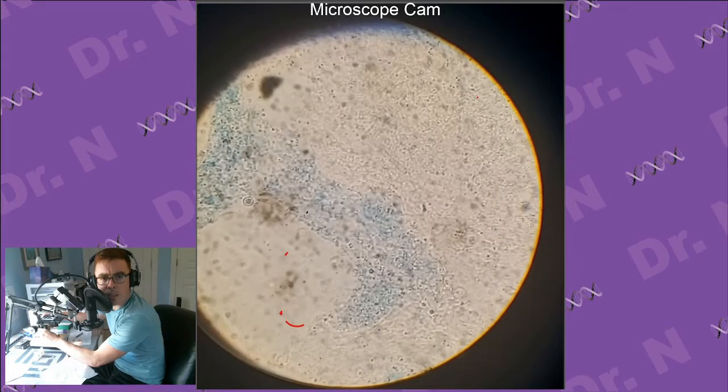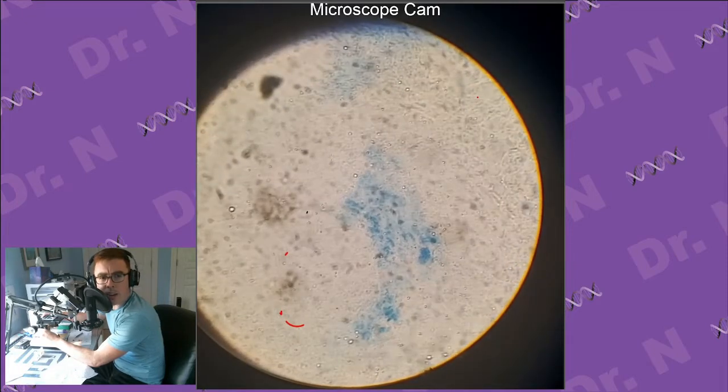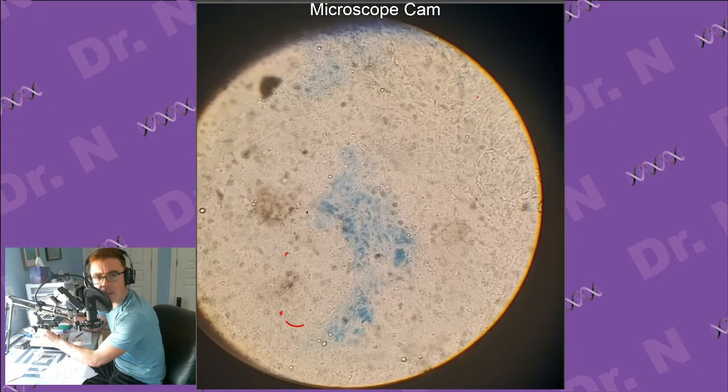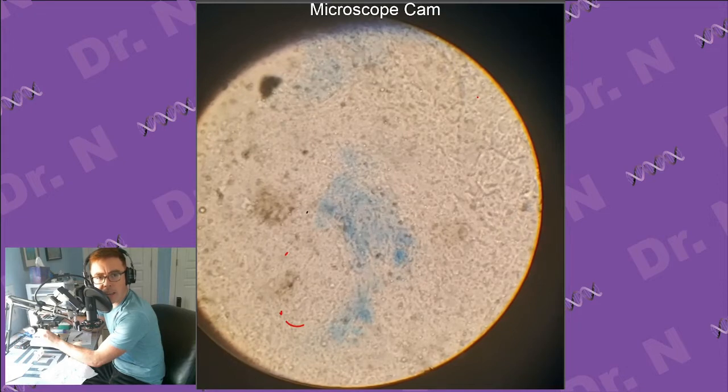Is this what I saw? Ooh. Oh, yeah. Okay. Sort of hard to tell. Yeah, I've got to figure out a way to clean off these lenses. They're quite dirty. These are just small cells. I think these are fat cells, so they're much smaller than the one I pointed out before.